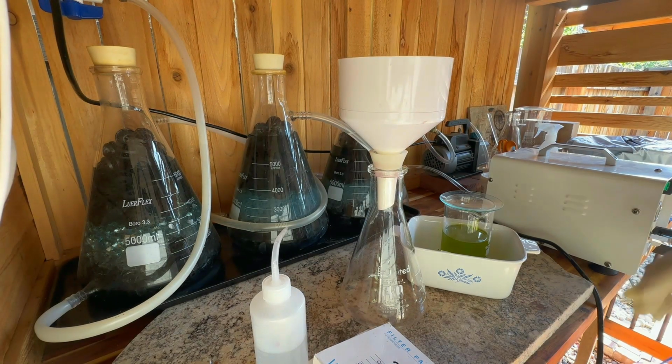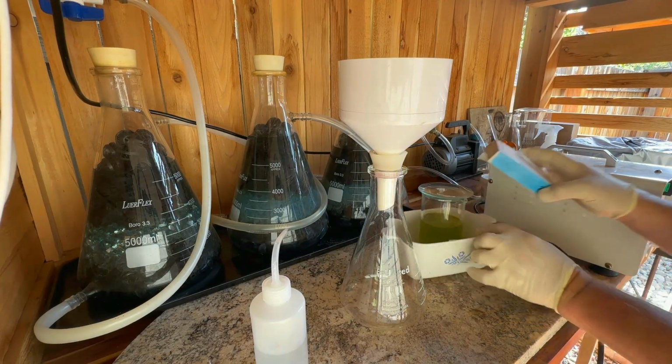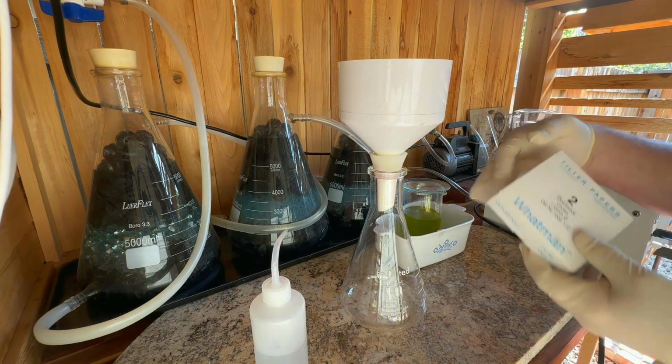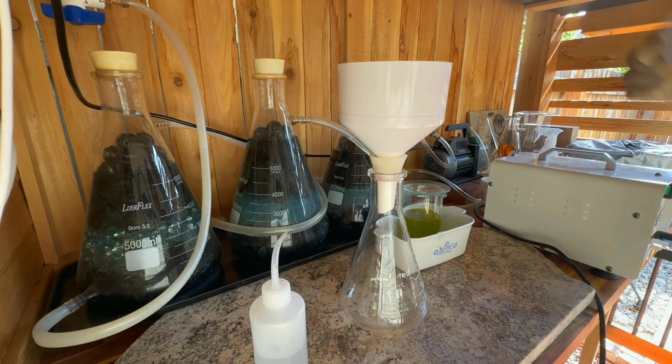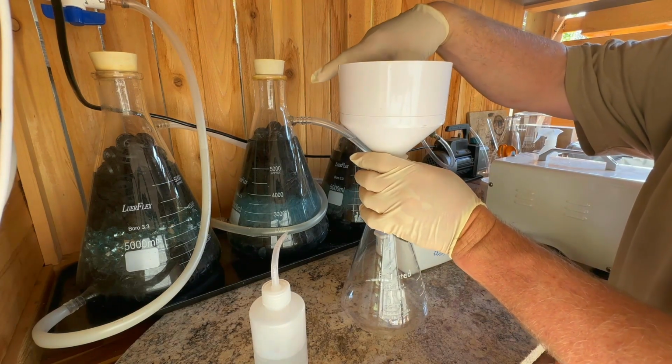So we'll go ahead and get our filter set up here. We're using our number 2 filters and our vacuum filter. Got the vacuum pump over here, and so we'll get that set up. Here we go, and you can see Whatman number 2. Keep going filtering until we get a nice clear, crystal clear solution.